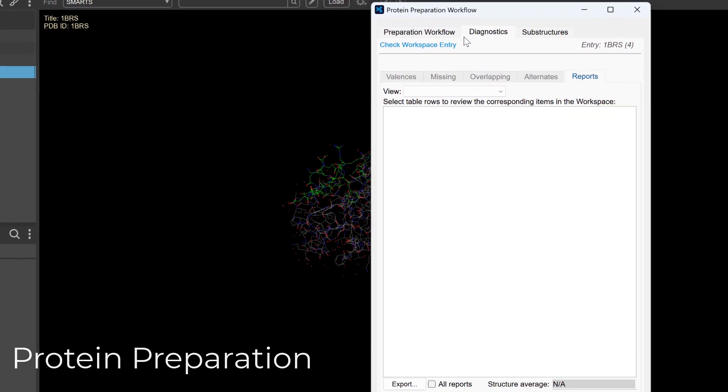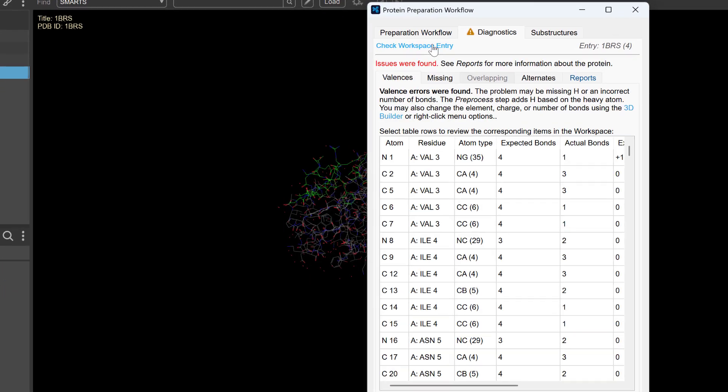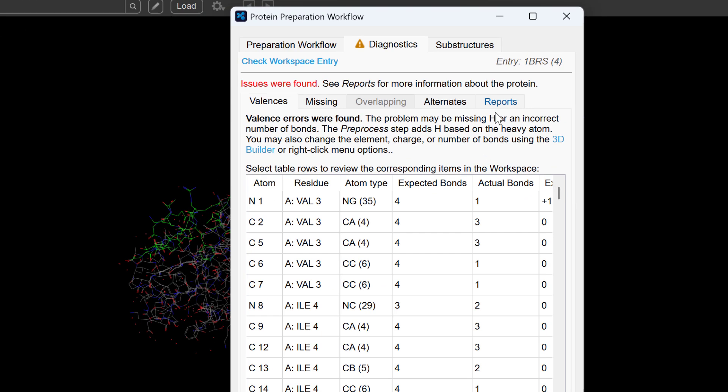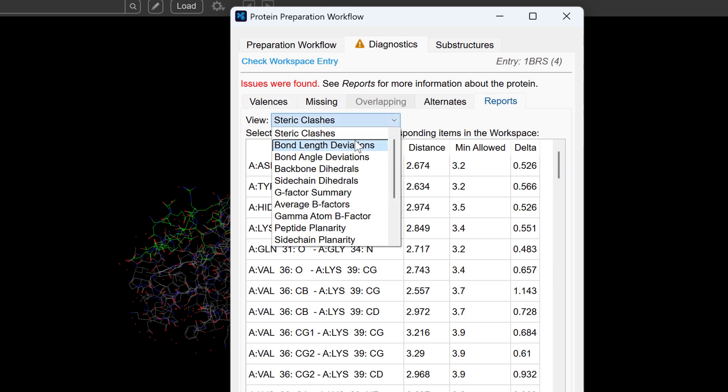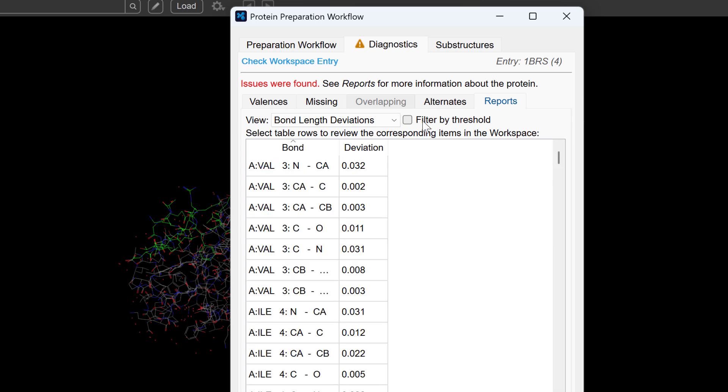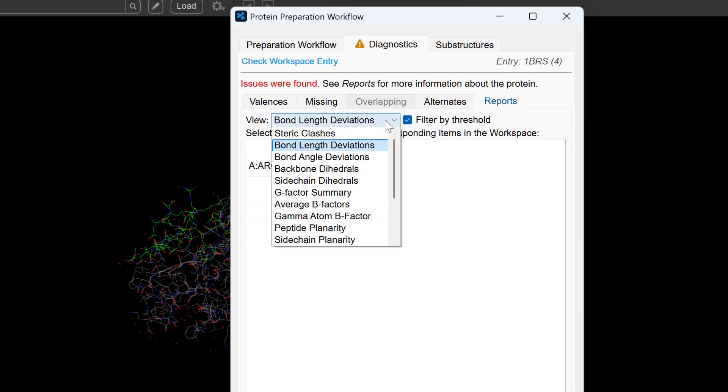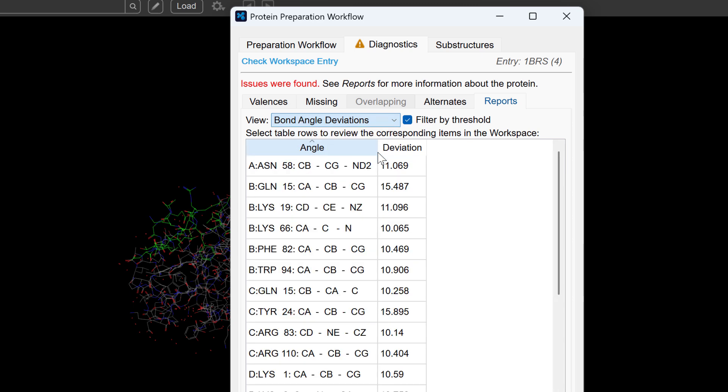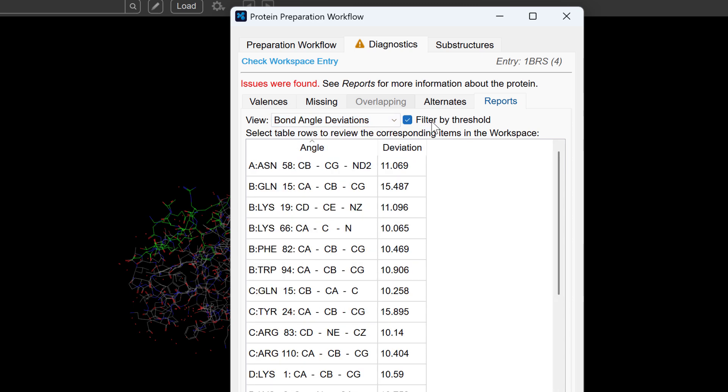Turning to Protein Preparation, navigating Diagnostics within the Protein Preparation workflow is now more efficient. To help you focus on significant structural issues, the Diagnostics Reports tab features a filter by threshold enabled by default. This automatically hides minor deviations below established thresholds, but allows you to quickly identify potential problems that need your attention.